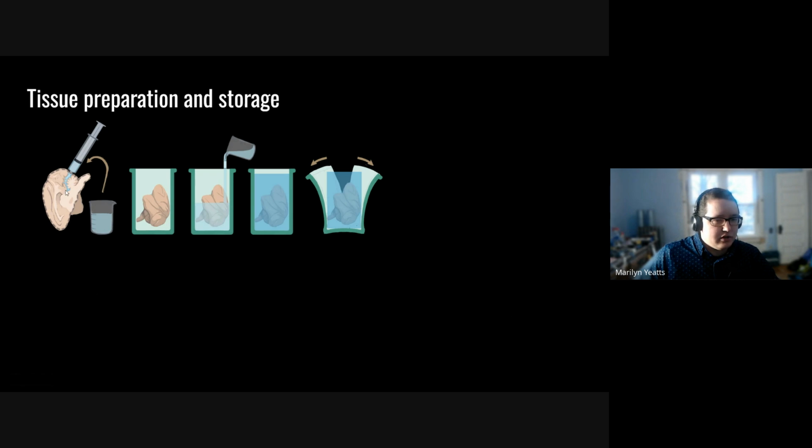You will inject liquid agar gel into the large sulci and spaces in the brain. So in this particular image example, you see that using a blunt tipped syringe, we inject this liquid agar gel into the space between the occipital lobe and the cerebellum, which is just a notoriously large gap that's hard to section because it's very difficult to get the embedding medium in there. So this is how we get around it. We just inject it in there directly before we do the next step.